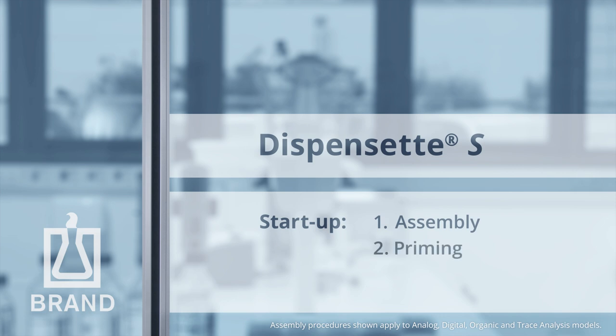Before using the instrument for the first time, ensure it's rinsed carefully and discard the first few dispensed samples.